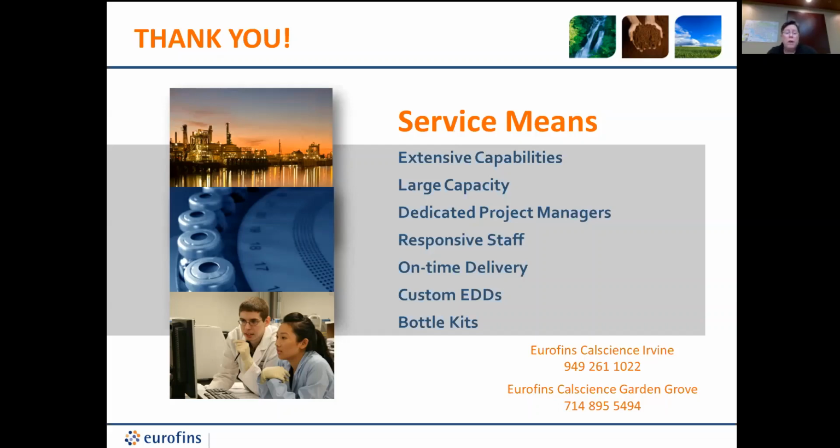They do look for it there. But for us here in Irvine, it's not requested frequently. Standard chlorinated pesticides and PCBs are pretty much our bailiwick here.